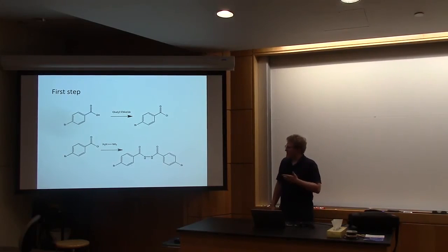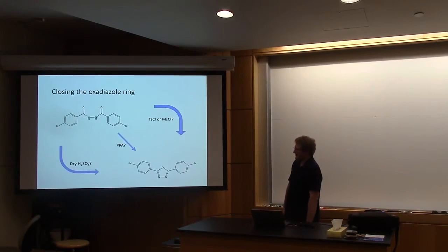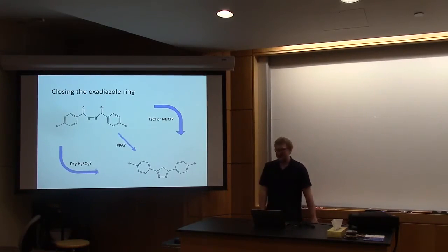So this was possibly the single easiest thing that I did in this entire synthesis. It does not get better from here, it only gets worse, as evidenced by this: closing the oxadiazole ring. I mentioned that it was well studied in the literature, right? Problem is that no one actually says very well how they made it.